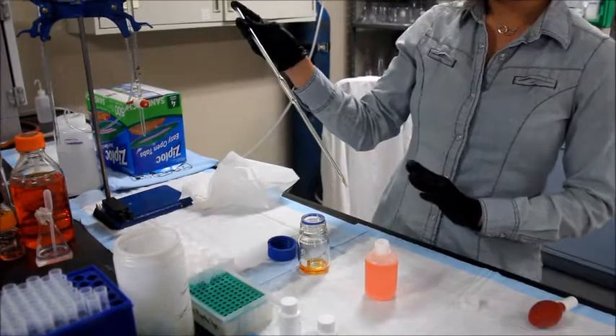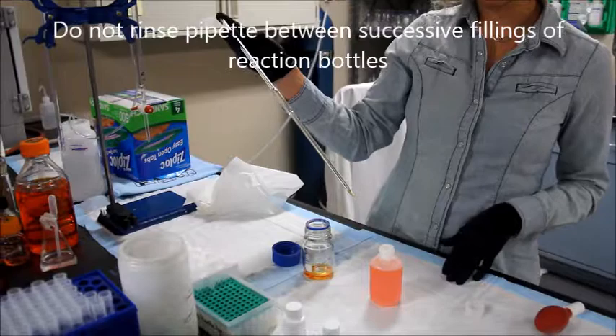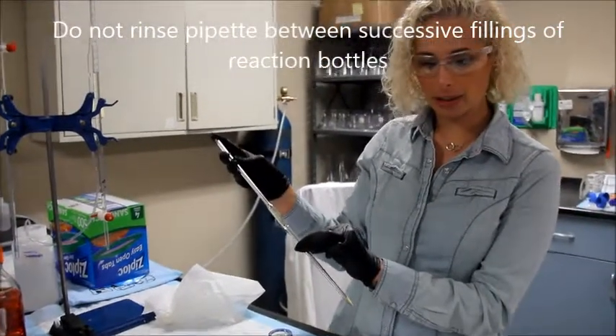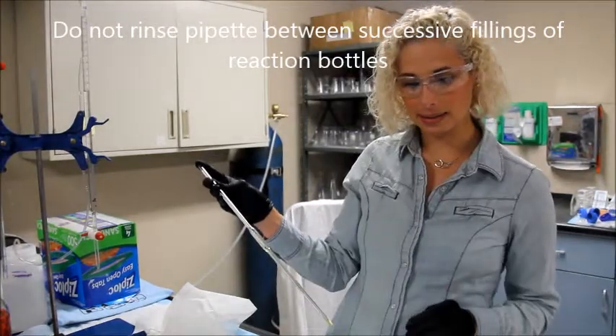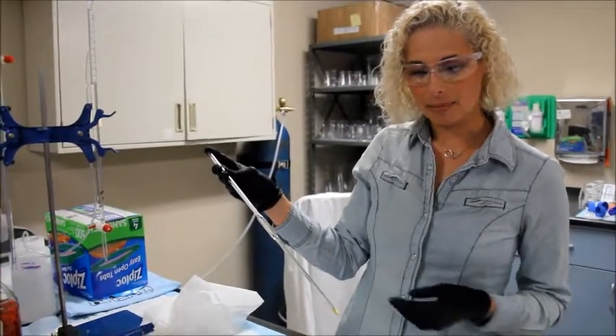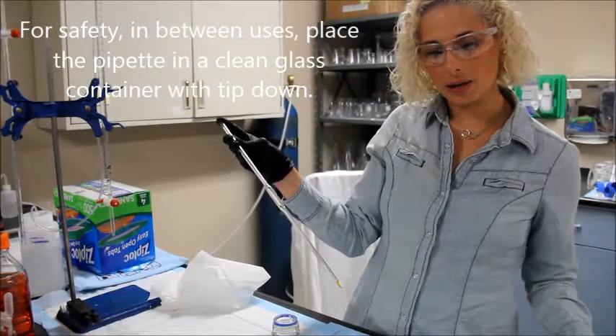Do not rinse the pipette between successive fillings of reaction bottles if you're doing multiple bottles. Instead, you can place the pipette carefully into a clean glass container tip down, or you can lay it on its side in a manner to prevent the tip from touching anything.